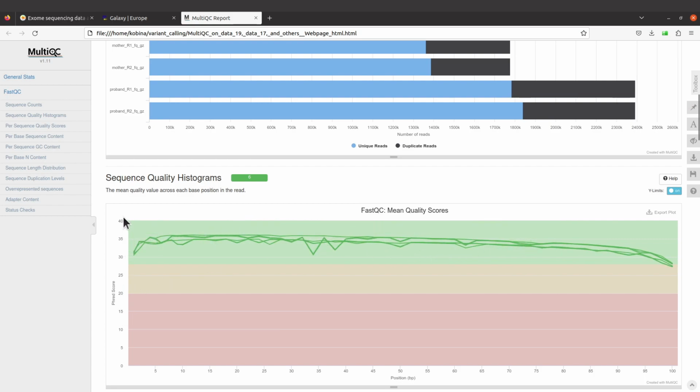Of course, the numbers are here, so you can also use that to track the scores. If it's here, somehow good, and if it's here, low quality, poor quality, the numbers also tell. So without having to use the numbers to make inferences, you can easily use the colors to get an overview.